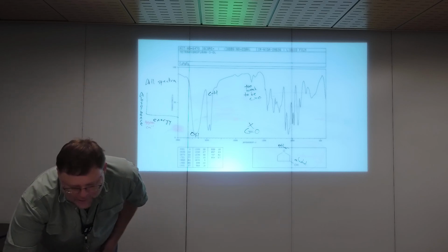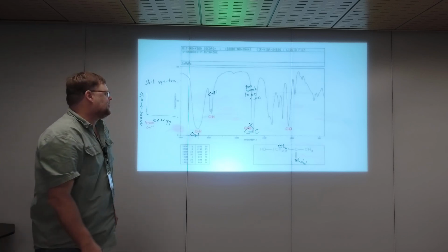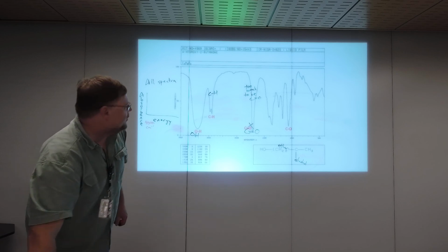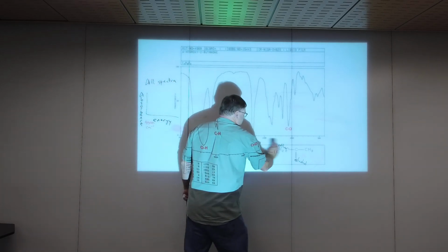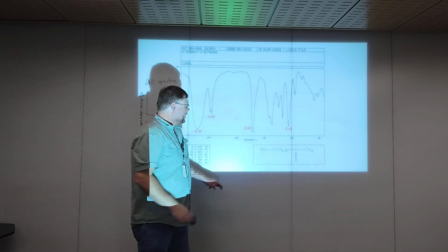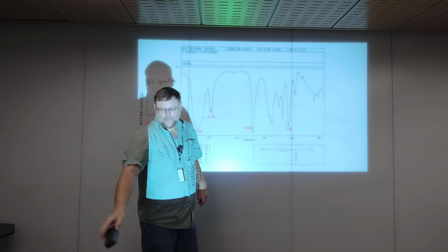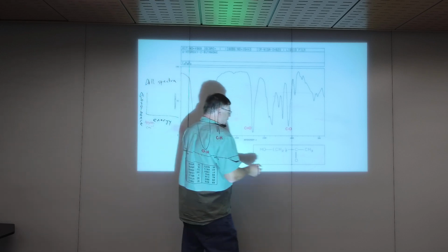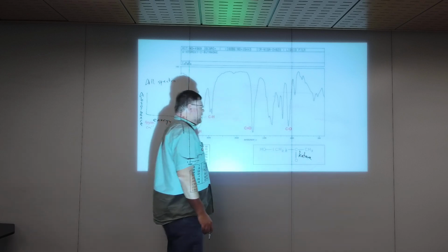All right, so I think you start to see what we're doing here. We're just finding functional groups. So if we go back here, now we have carbon, carbonyl, carbon. That's a ketone. Like I said, there are a bunch of these carbonyl-containing functional groups.